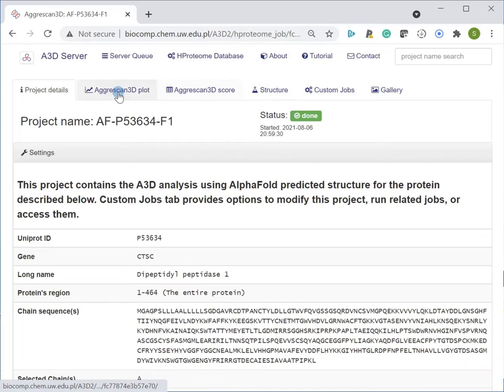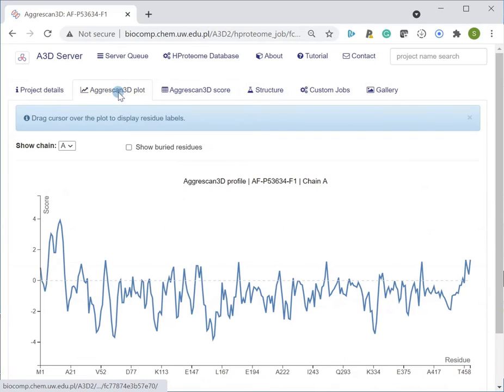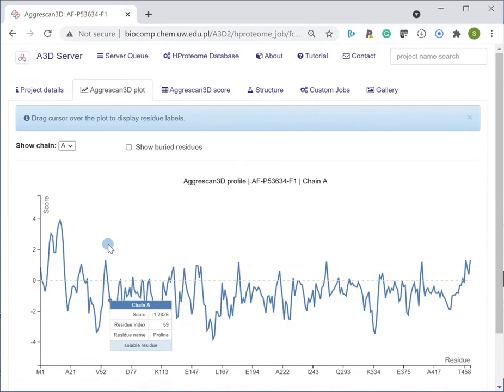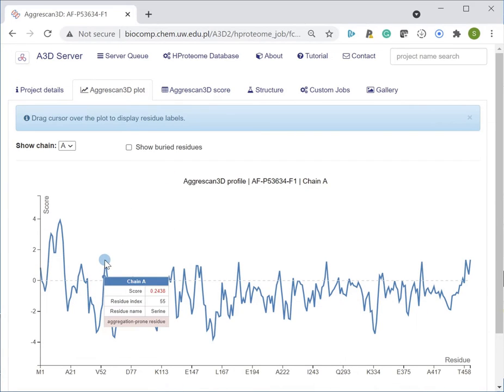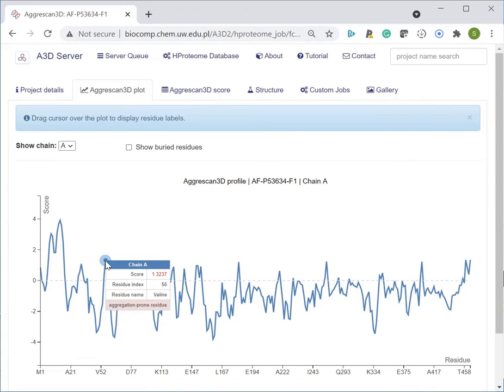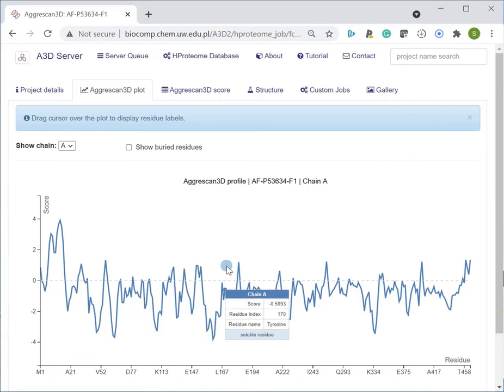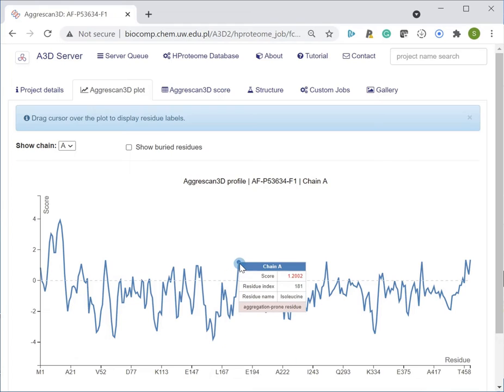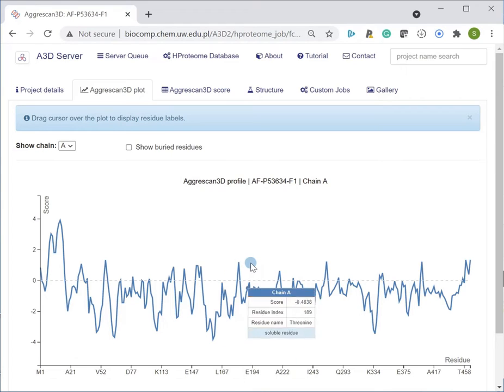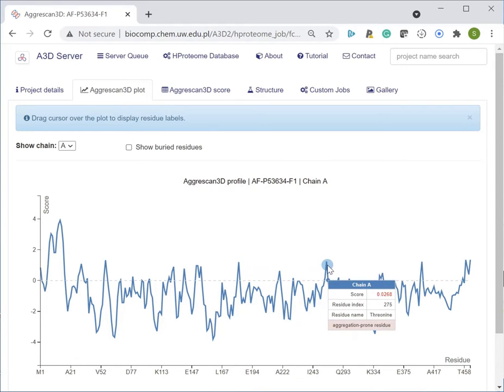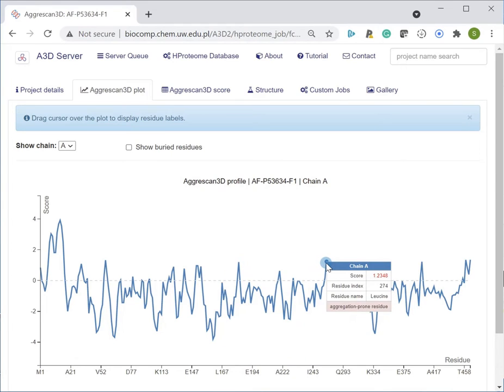For example, on the A3D plot page, protein residues are described using the A3D score. The high score indicates residues forming aggregation-prone regions.